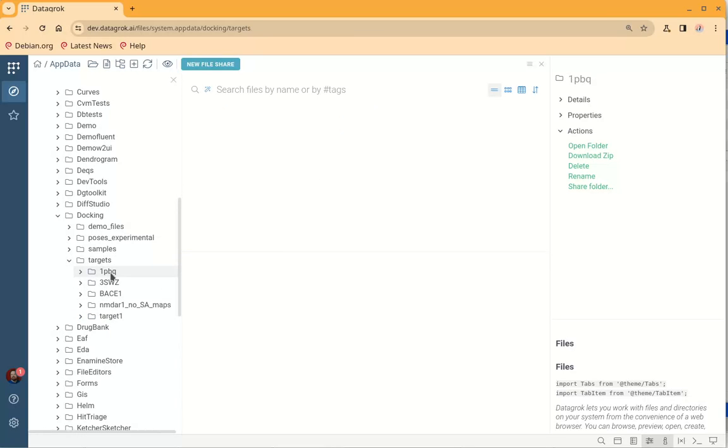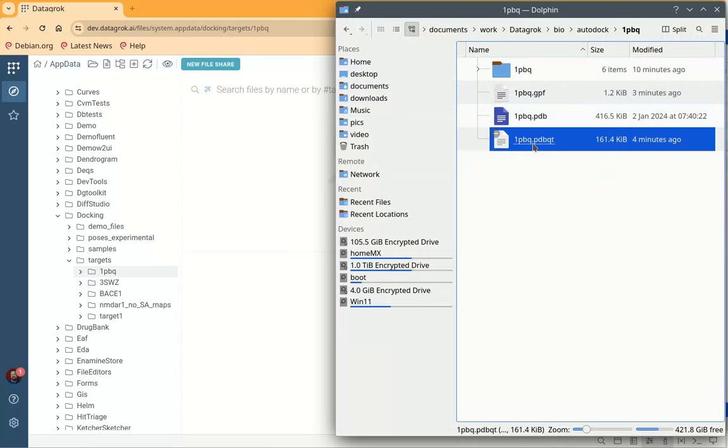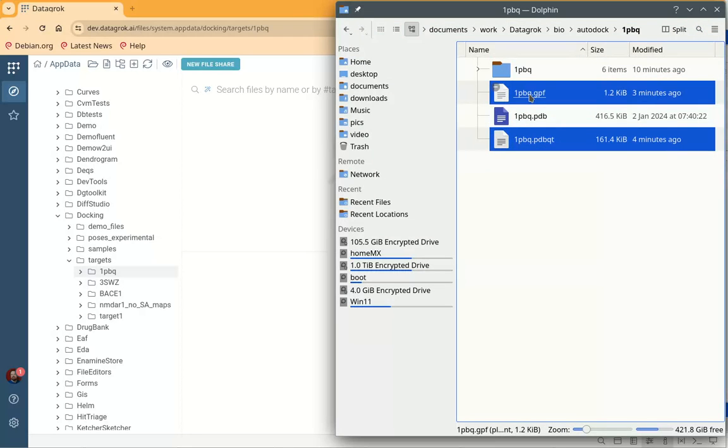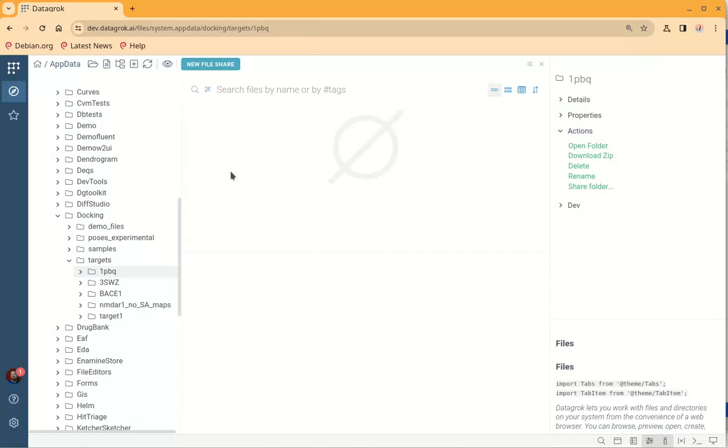Then we go to this folder, choose the PDBQT and GPF files and just upload them to the Datagrok files. And that's it.